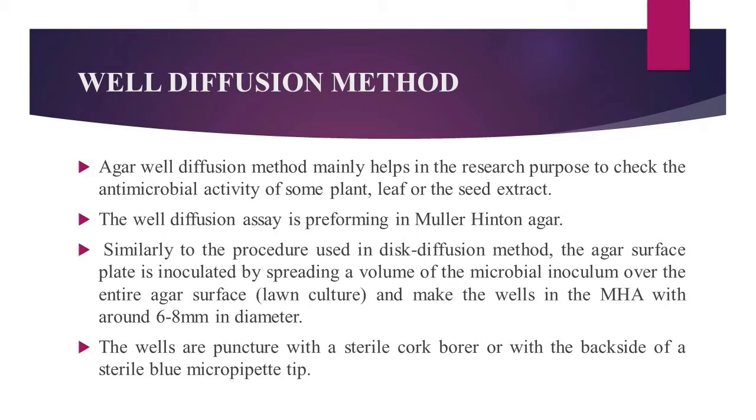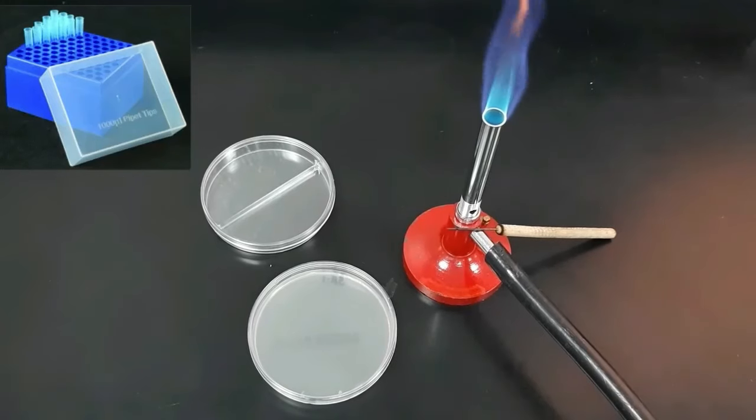The wells are punctured with a sterile cork borer or with the backside of a sterile blue micropipette tip.